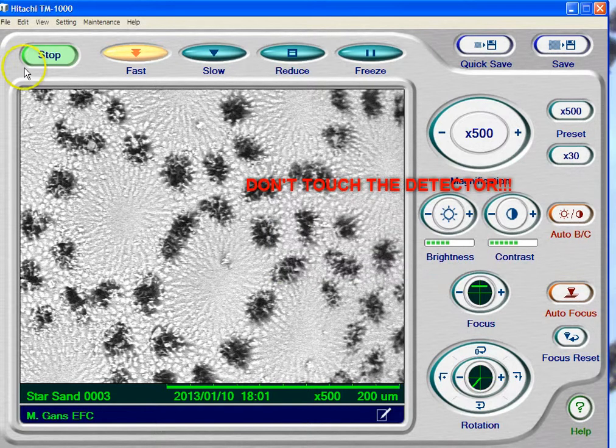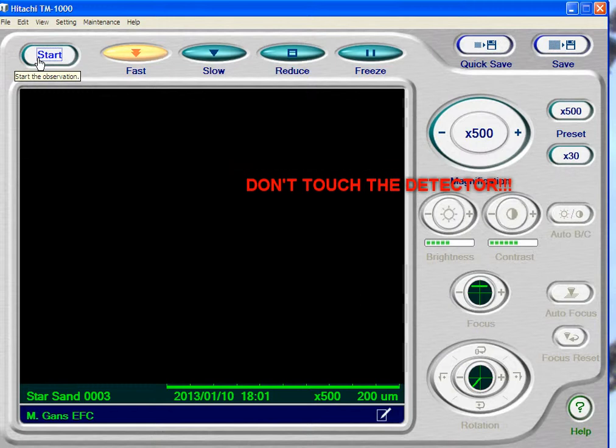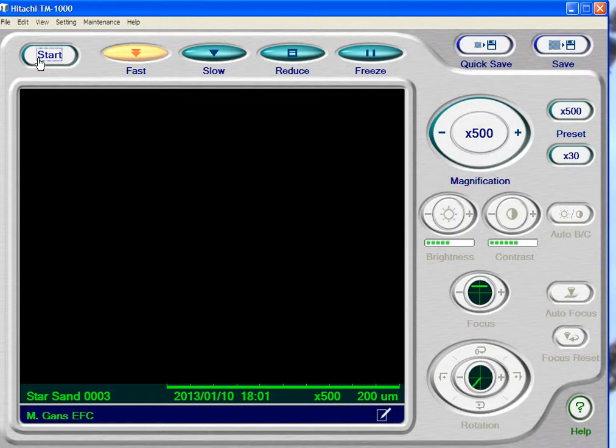I'm going to put Cancel here, then hit Stop. Once you get a black screen, then you're ready to take your specimen out. Okay, that's it for the TM-1000.